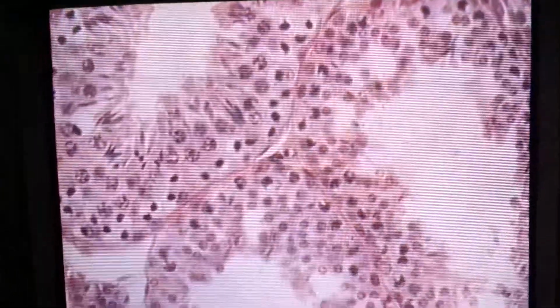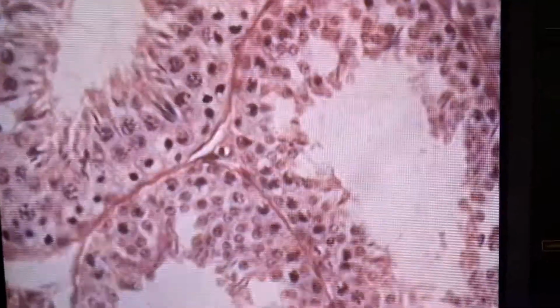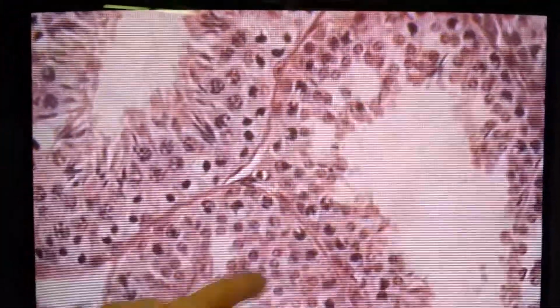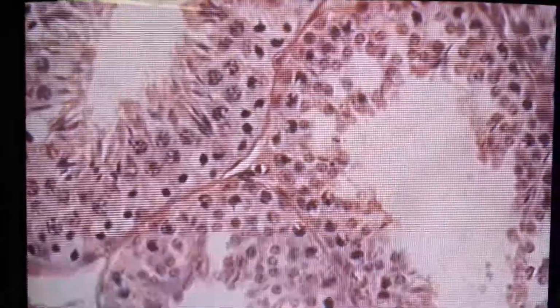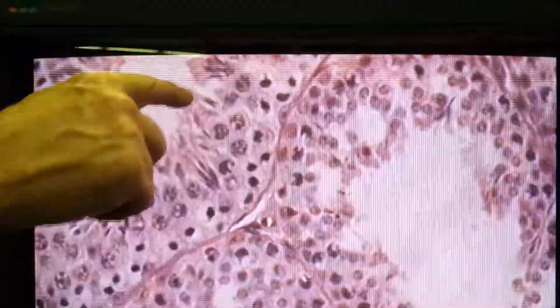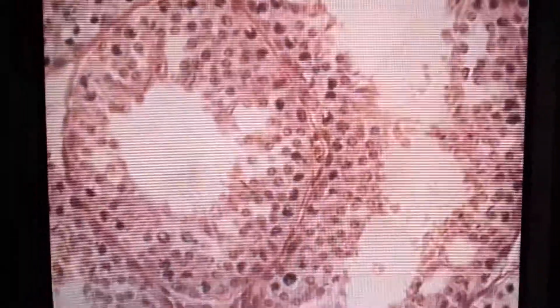Where are those polar bodies? No, there aren't any spermatids there. They're all maybe just residual bodies because they've all hatched. Where are the residual bodies? These are spermatids, though. Dr. Brent, where are the residual bodies? Here, that's sort of these things. They have no DNA left and no nuclei. It's sort of like the eggs that the sperm have hatched out of.